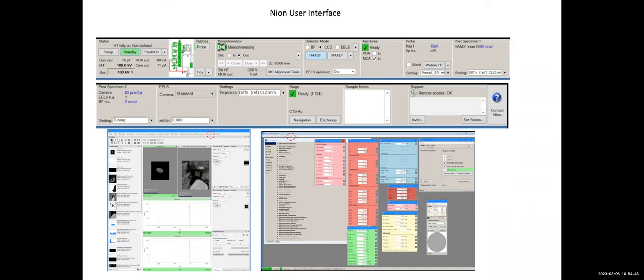So that is something interesting because once you process this data, for example, you acquire a 10 EELS spectra and you sum them together into one spectra, right? So you acquire these 10 frames 1 hour ago, and then you do a summation now, it will show the position of the summed image in now. So it will be grouped together with some new data. So you lost the connection. So that is something you need to pay attention to.